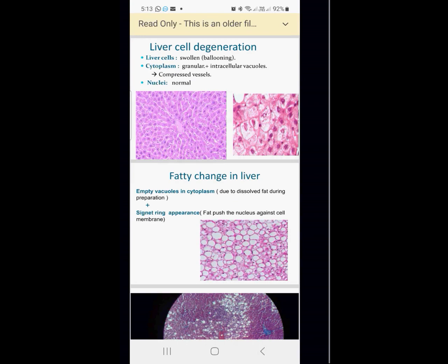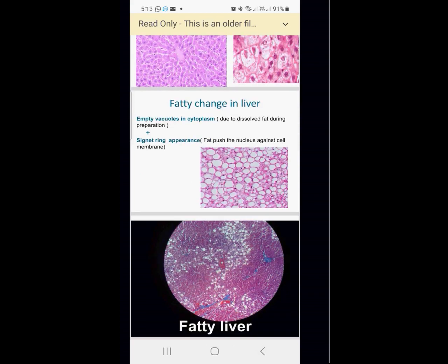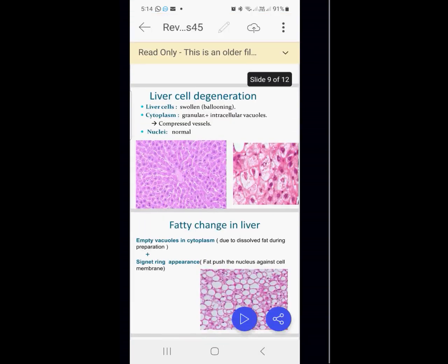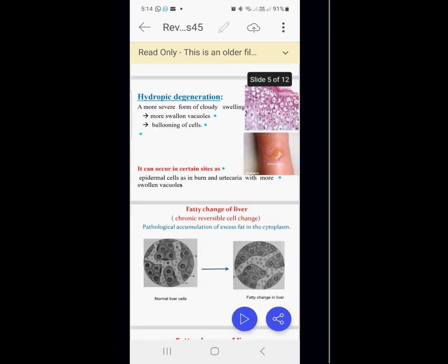The most characteristic point to differentiate between them is the macroscopic, because the fat or the lipids, when it goes under the process of staining and melting, the fats will dissolve. Still you see more spaces, more vacuoles. Under microscope, you see the spaces. شايفينها؟ لأنه الفات حصل لها degeneration by the substances اللي انت عملت بيها. More or less under microscope it will appear like the hydropic changes.